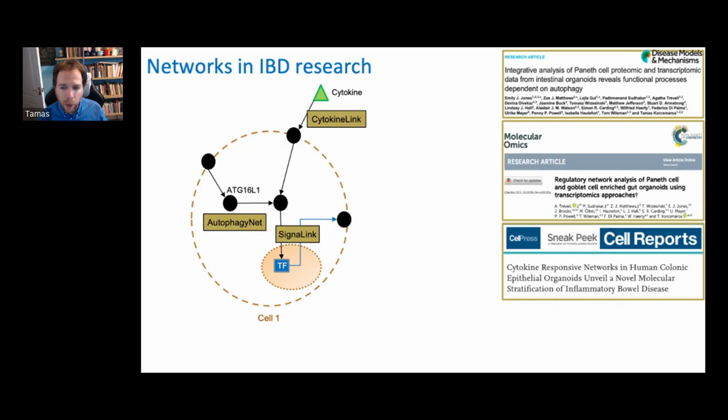With the group of Nick Powell, we did a really interesting study where we exposed human organoids to different cytokines and captured the effect of these cytokines. We were able to show that there is some kind of overload in certain processes, and you can identify a profile of that, which very nicely resembles the biopsy transcriptomics, which contains many other cell types, indicating that organoids could be really good for mechanistic studies on cytokine interactions.